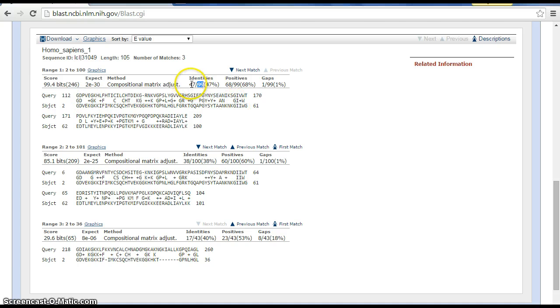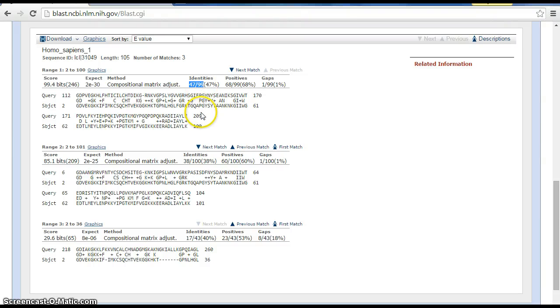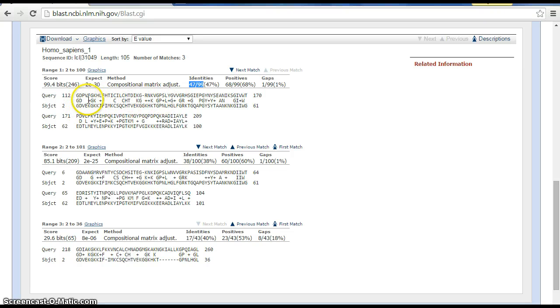What this means is that 47 out of the 99 amino acids match, and therefore the remaining 52 amino acids don't match for species one and Homo sapiens. Those remaining 52 can be found by the blank spaces or the plus.